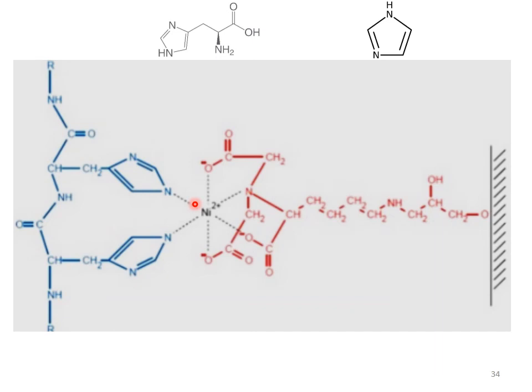One important significance of affinity purification is that only the required protein which has high binding affinity to the stationary phase can bind to it. All other proteins will not be bound to the stationary phase. And then by using a suitable competing agent, the protein of interest could be released from the column and hence could be collected.